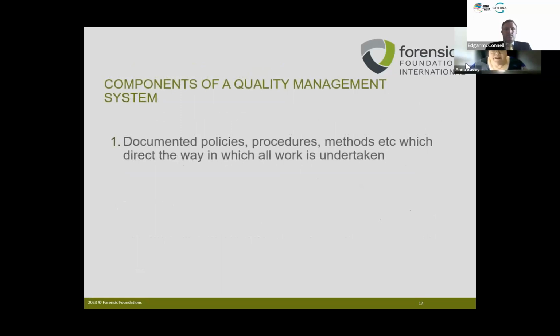So, just breaking these down in a little bit more detail. As I said, everything needs to be written down. I remember reading somewhere, and I haven't been able to find the quote since, that if it isn't written down, it didn't happen. Write things down. You think you're going to remember things, you think things are obvious, but they won't be obvious. What's obvious to you may not be obvious to somebody else.